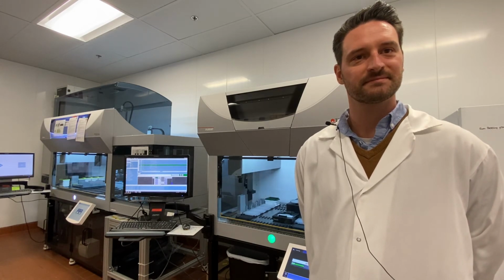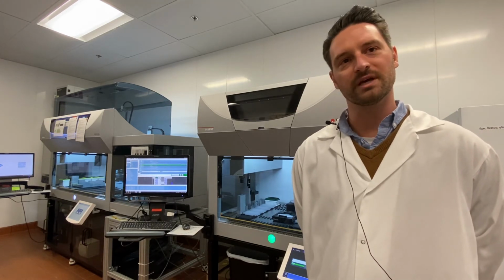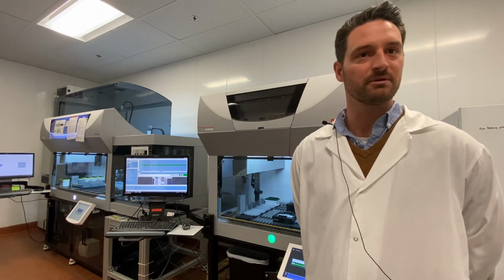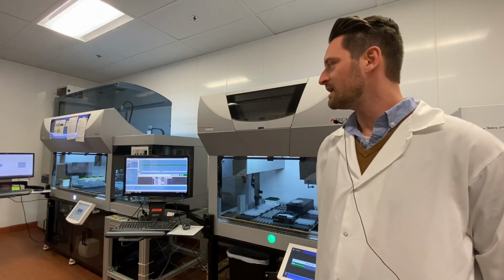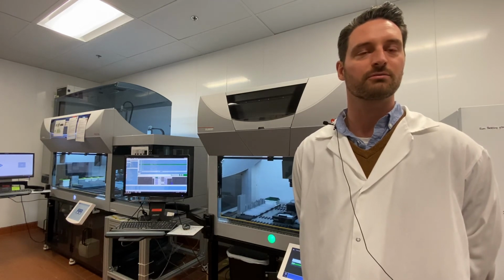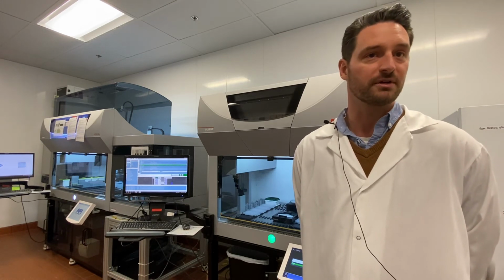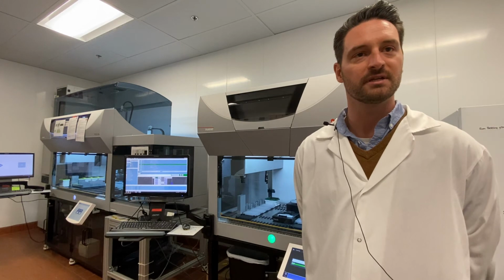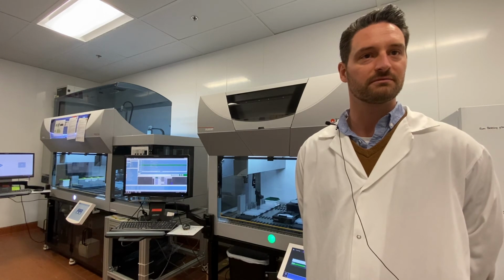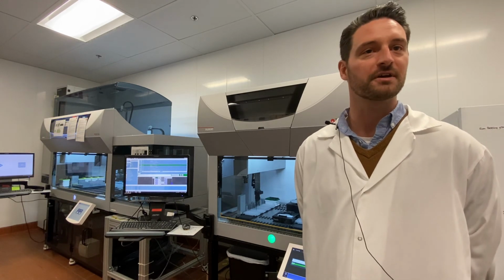And how will robotics change the results that you're seeing? Using these platforms really helps with increasing our data fidelity, making sure that human error is kept to a minimum, if not eliminated in certain situations. In particular with our genomic DNA extraction and purification, it really increases the throughput. We're able to do thousands of isolates in a day, as opposed to maybe a couple hundred for one person to handle over a single work period. We also see greater yields and greater quality of sample results afterwards. So it's really helped out a lot with making sure that we're able to give the best benefit to the customer that we possibly can.